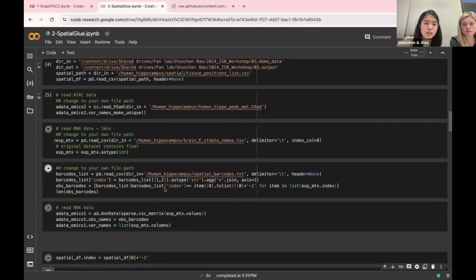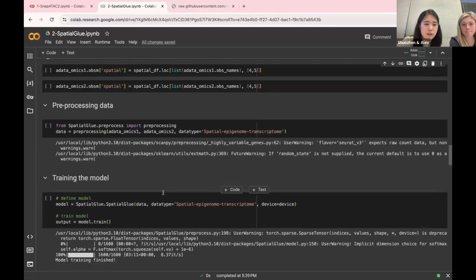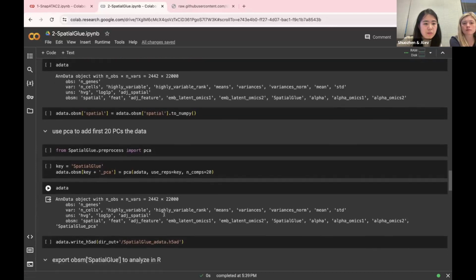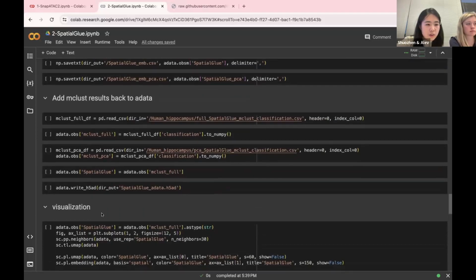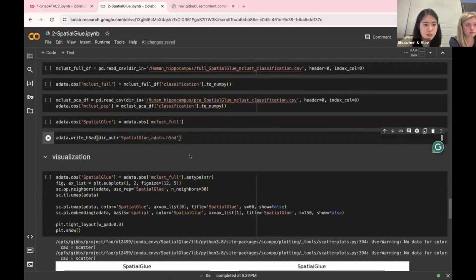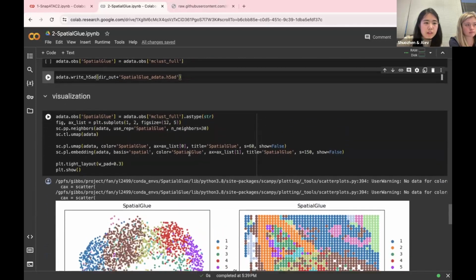Due to the time restriction, we might not be able to finish everything in the following part, but it should have the data we need. Every step, if there are intermediate results, is all saved in the Google Drive. So you can go ahead and find it in the Google Drive and plot it.